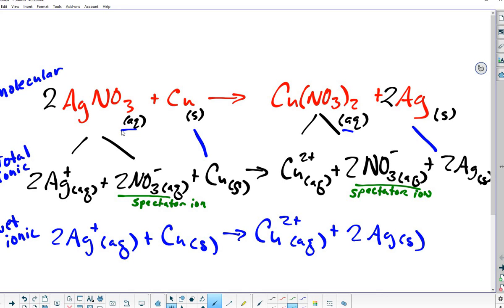Okay, so now, what did I tell you about the last part of the lab that you needed to be really careful with? Won't burn yourself. No. It was with the well plates. Something really important that you needed to know. Oh, pick which ones are solid. Yeah, you only have 4 solids, so you need to make sure you identify the 4 solids. Okay, which one are you going to start with when you go back into lab? Single displacement. I will pull you when I get the others set up, and I'll just say, okay, it's time to come. So try and get the single displacement set up before I come back to lab. So that can be running while we're watching the other part. Okay? It is individual. You're doing it on your own. You might have to share a station with somebody, but you're doing your stuff on your own. Okay? You're responsible for your own work.